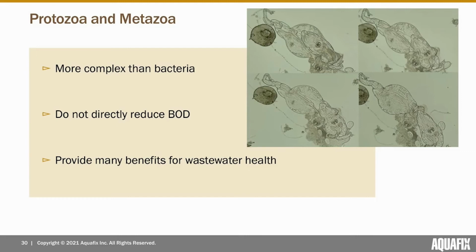I was actually lucky enough to witness a rotifer being born, and it was probably the highlight of the best 18 minutes I've had watching that being born. But as you can see how complex those organisms are, especially with their digestive tracts, that's what takes them a while to grow.